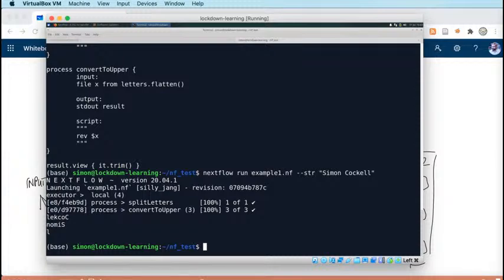You can also tell your script where you want it to run a particular process. So you can define things called executors. At the moment, the executor for my script here is what's known as the local executor. So it's running it on the local compute.